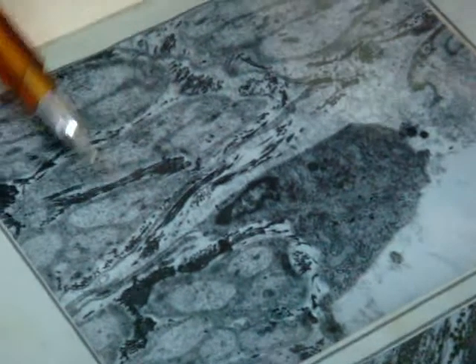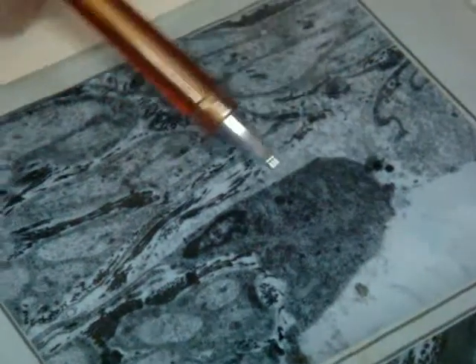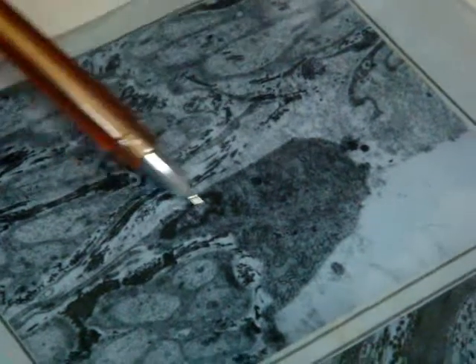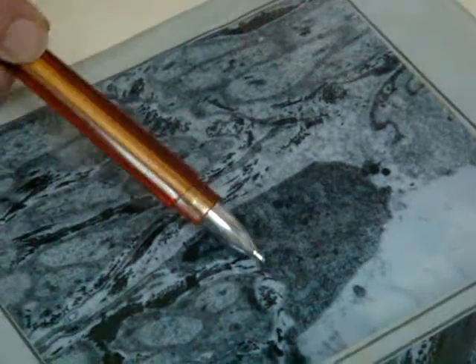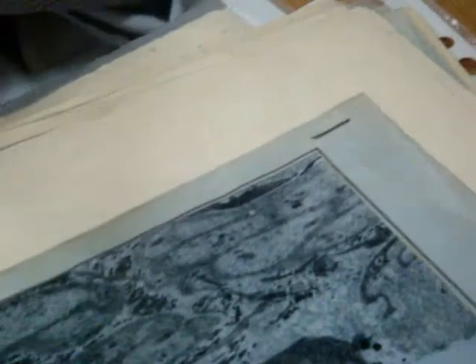We do the same with this new one. Look please, this is an oblique section through an unmyelinated nerve fiber. We can see axons that are surrounded by the cytoplasm of a Schwann cell. Between them, we can see connective tissue with collagen fibers. And this is one part of a fibroblast, maybe a perineural cell. A perineural cell must be surrounded by basement membrane from both sides. A connective tissue cell, no. Let's look attentively.